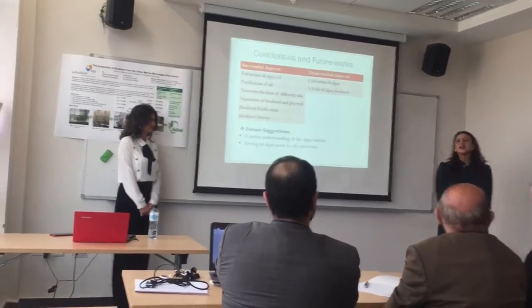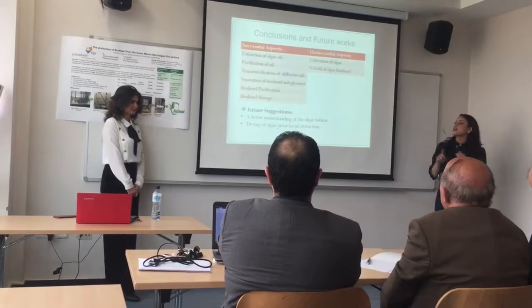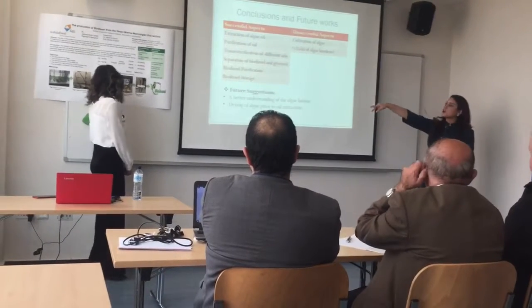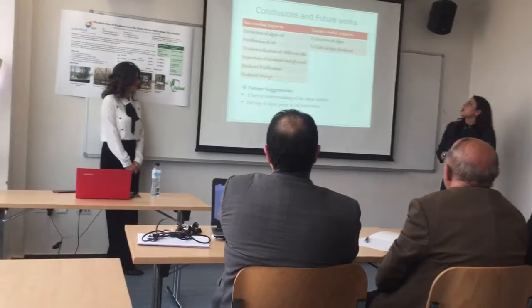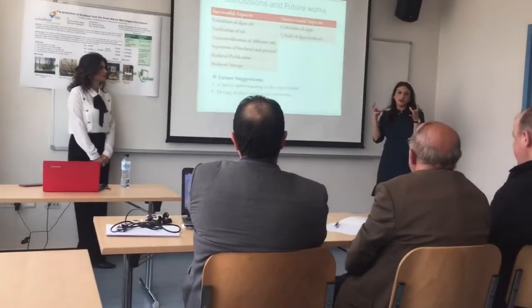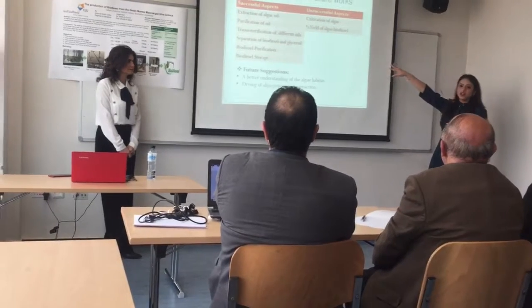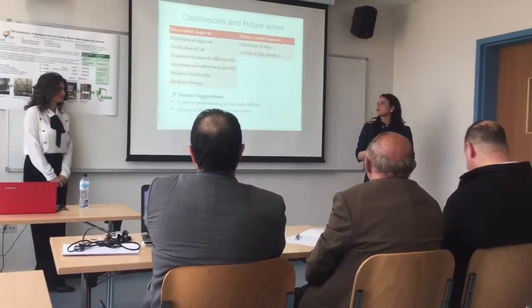To evaluate our work, we thought that our successful aspects were the extraction of the oil, the purification of the oil, the transesterification reaction of the different oils, separating the biodiesel from the glycerol, purifying the biodiesel, and finally storing the biodiesel. However, we felt like we fell short in cultivating the algae since after a few weeks it began to shrink and change color. It began to discolor, which is why our percentage yield was really low compared to all the other ones, since we had a really small volume of oil to work with.